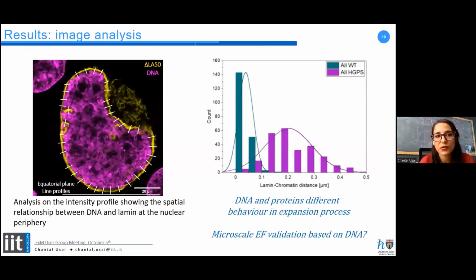But since we are using expansion, and the 2 structures that we are examining are one based on DNA and the other a protein, we would like to investigate the different behavior of these 2 structures during the expansion. So we would like to try a microscale expansion factor validation based on DNA.